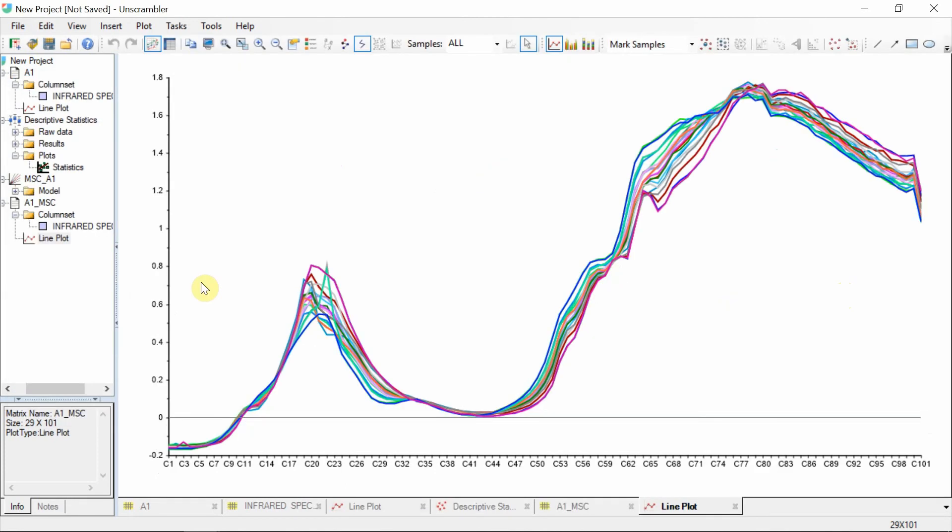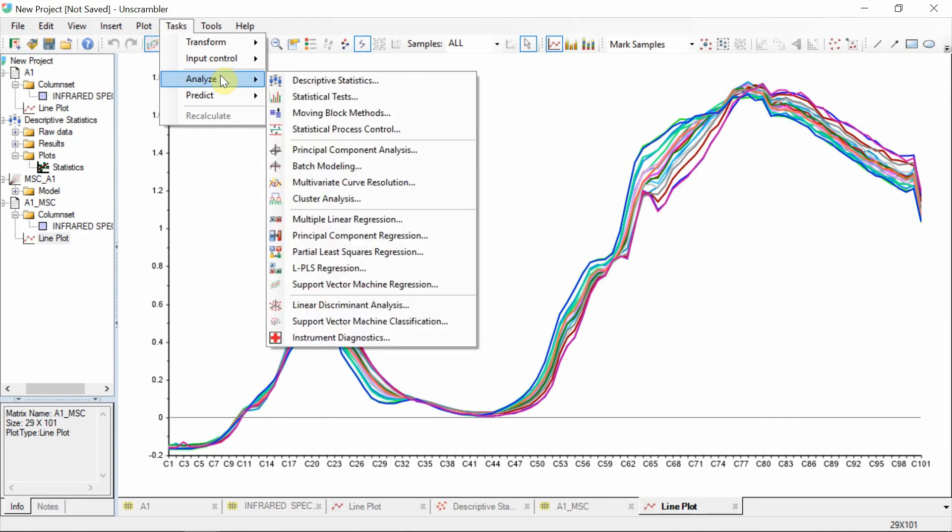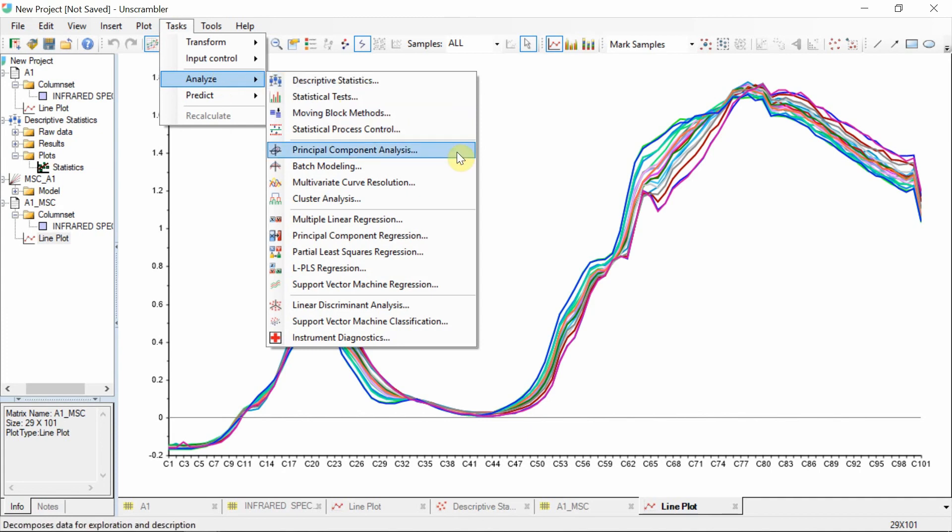To proceed to perform multivariate analysis on the spectra, go to Tasks Analyze and select the desired method. Principle component analysis is a very common method.